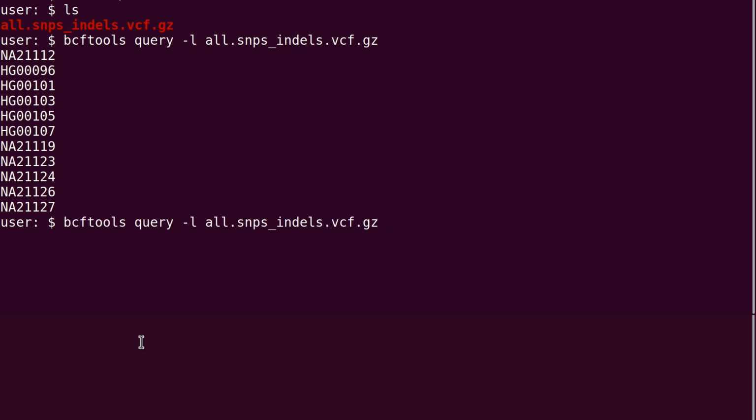That means this same command we used here, I'll just use this greater than sign, showing that we want to redirect the output to a file, and then I'll give the file name. So let's leave it like samples.txt. This is how I'm going to do it, so that I have the sample IDs here. I'll just execute this, and then it's there.